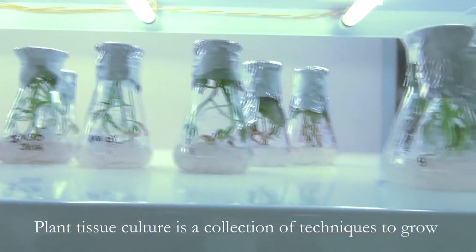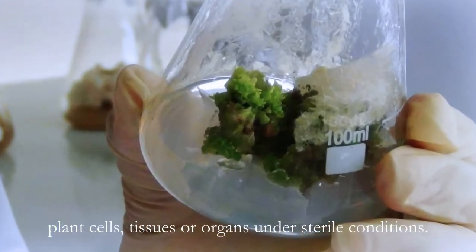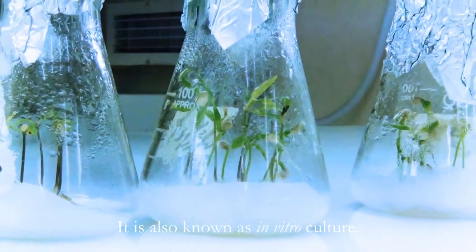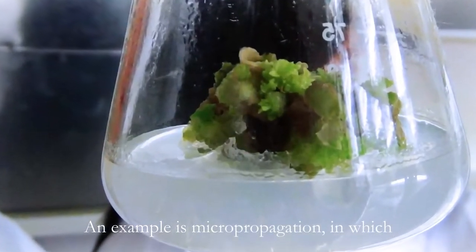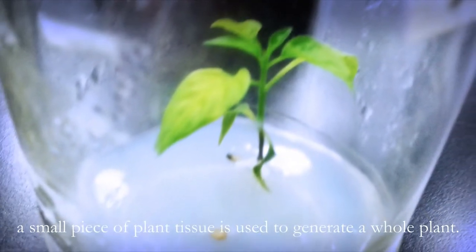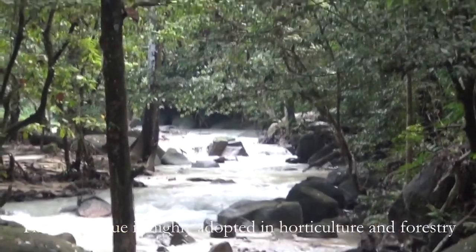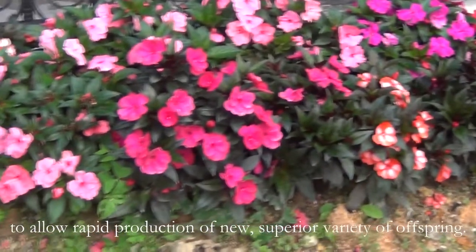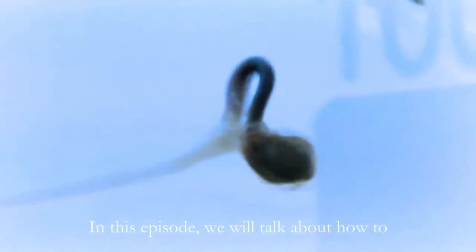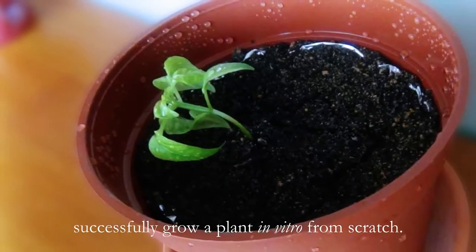Plant tissue culture is a collection of techniques to grow plant cells, tissues, and organs under sterile conditions. It is also known as in vitro culture. An example is micropropagation, in which a small piece of plant tissue is used to generate a whole plant. This technique is highly adopted in horticulture and forestry to allow rapid production of new, superior variety of offspring. In this episode, we will talk about how to successfully grow a plant in vitro from scratch.